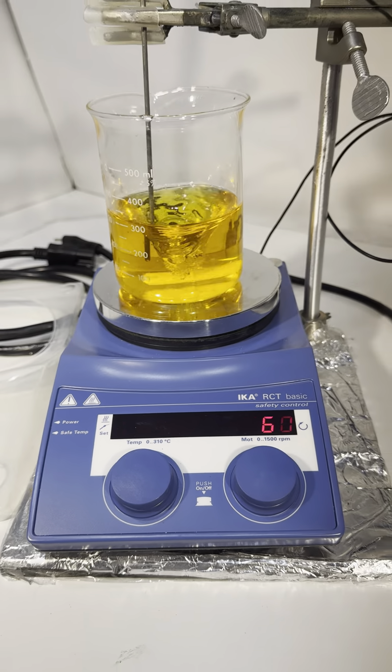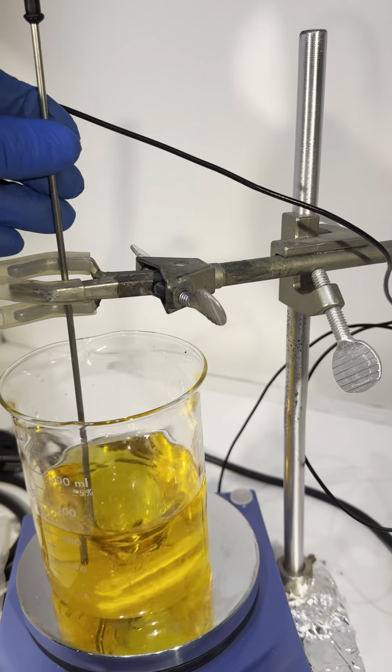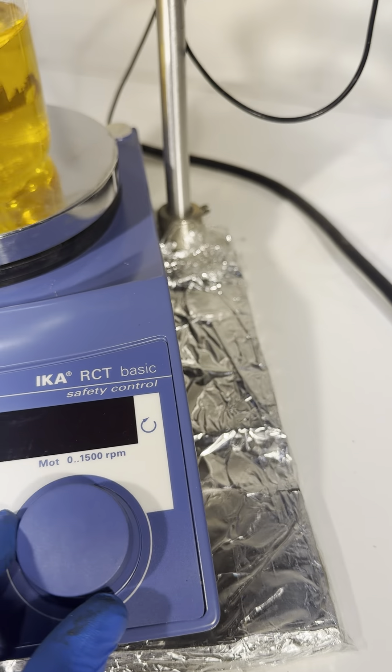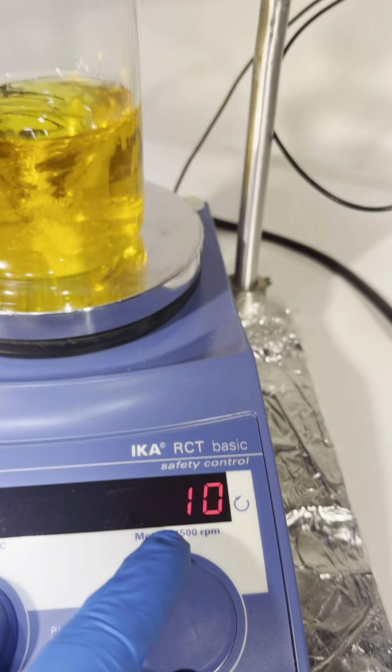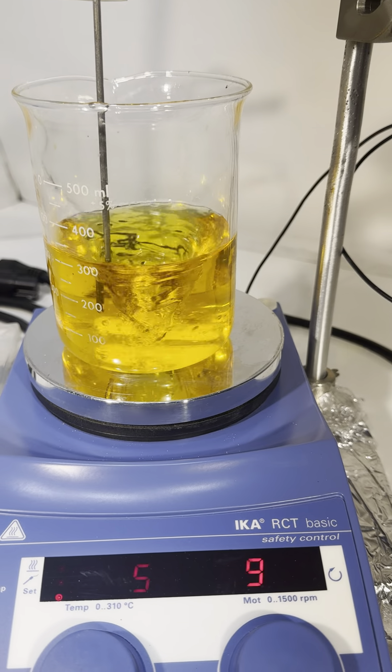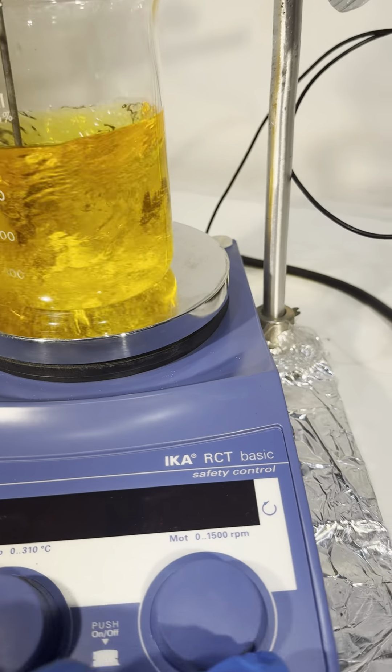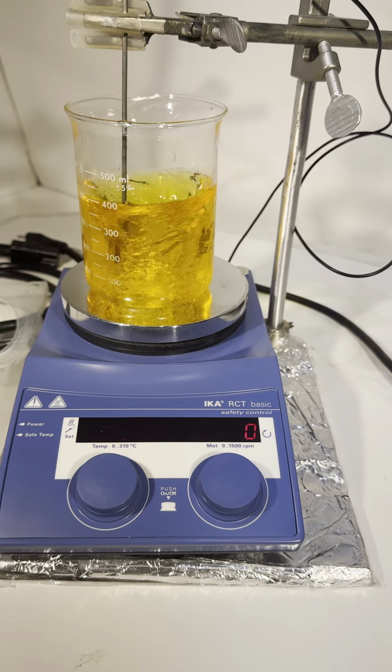It comes with a probe for inside. You can go from zero to 1500 RPM — you can increase it. Nice and smooth — you see, even at 1500 RPM it's just perfectly okay.